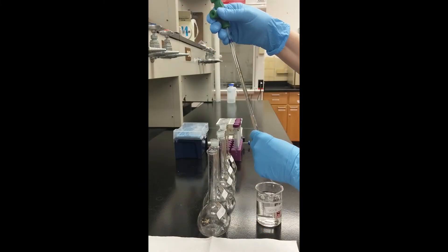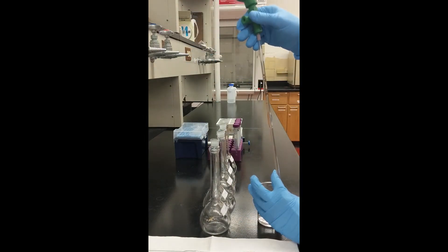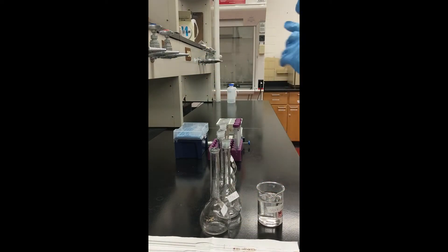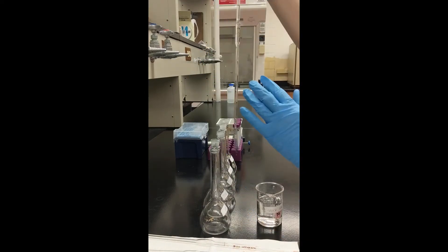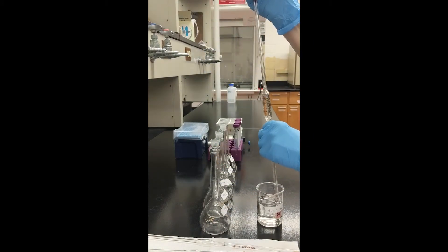Continue measuring out stock standard solution using various sizes of volumetric pipettes for all calibration standards. When finished, fill each volumetric flask with deionized water to the fill line, making sure that the meniscus is at the correct level of the flask's fill line.